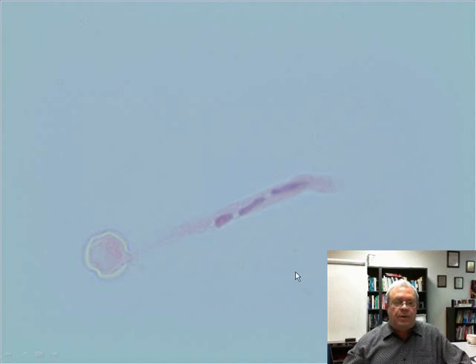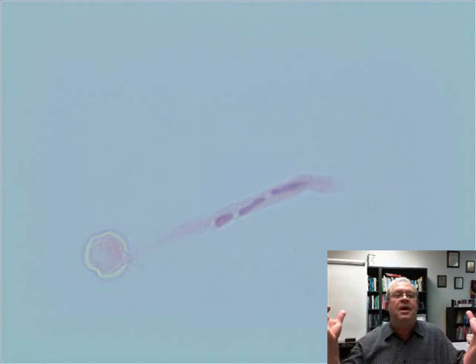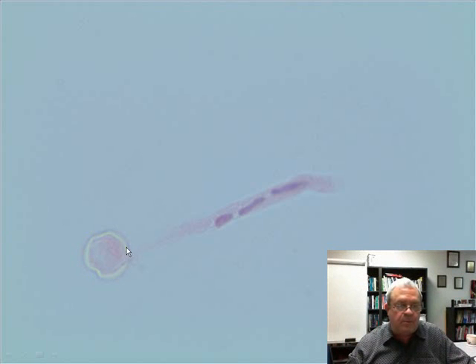Hello there, what do we have? We have a pollen grain here and a tube growing out of that pollen grain. A pollen grain and a pollen tube. You say, where'd the flower go? Well, this is a very disappointed pollen tube. It was artificially stimulated to grow without a flower, and so it's the pollen tube to nowhere. Anyway, so it's pollen grain, pollen tube.